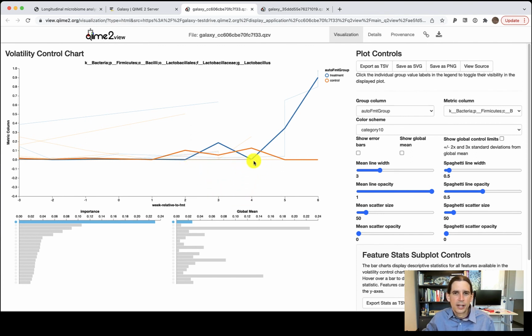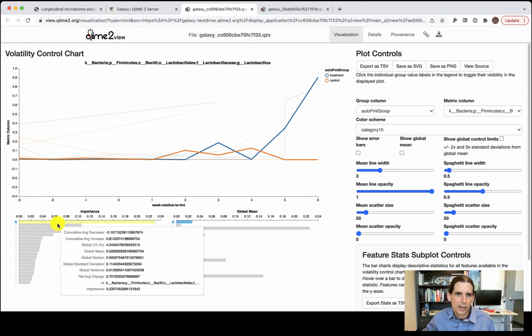Not a whole lot. Remember that when we come out here, we have very few samples left, and so this is not a particularly interesting region of this plot. But what I suspect is happening is this is a very low abundance feature, and so we're losing some of the signal in just the small area that this is plotted in this figure.